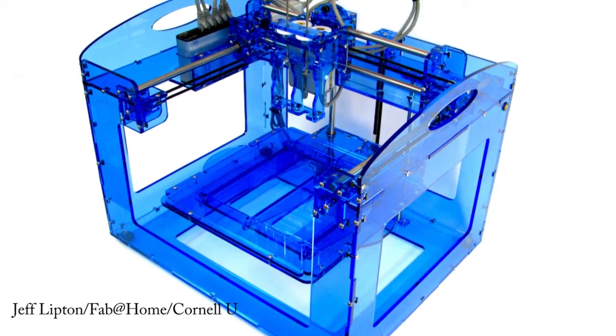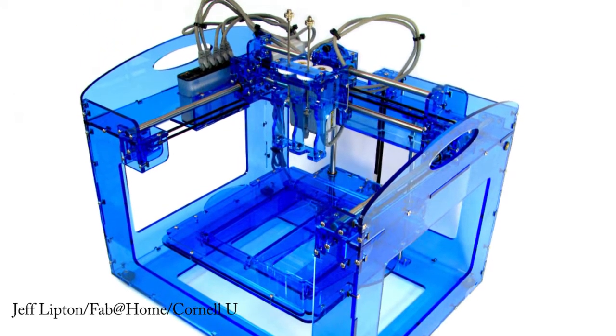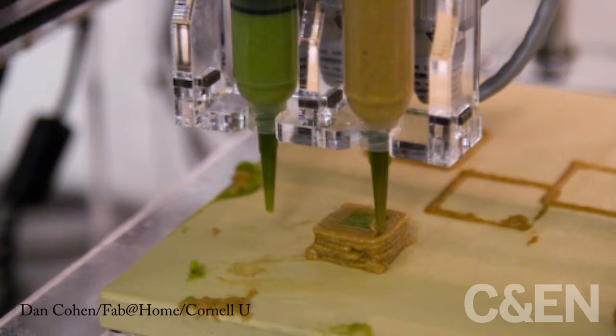3D printers, those machines that can fabricate complex three-dimensional objects layer by layer, are an up-and-coming technology.